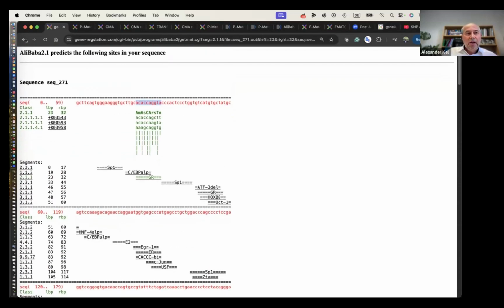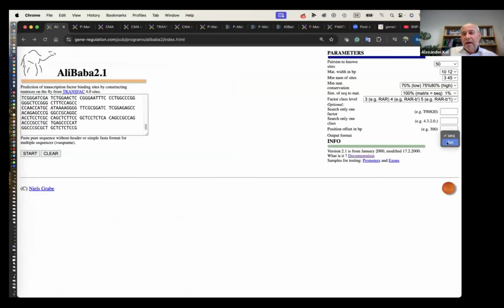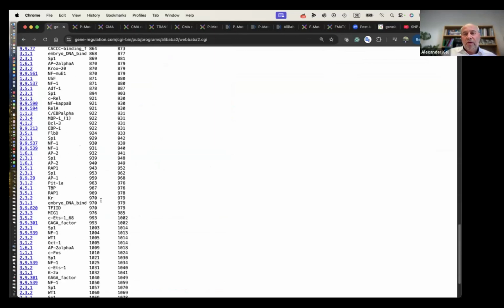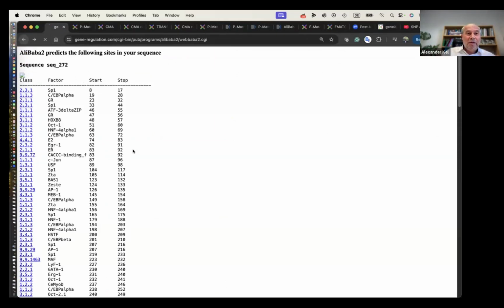You can also get this as a list, which you can output and use for your further purposes. And what kind of purposes are you going to use it for? That's something we are going to discuss today.